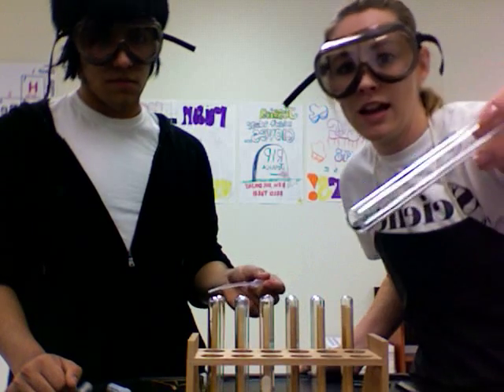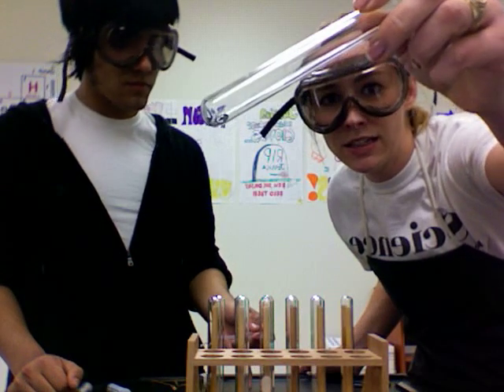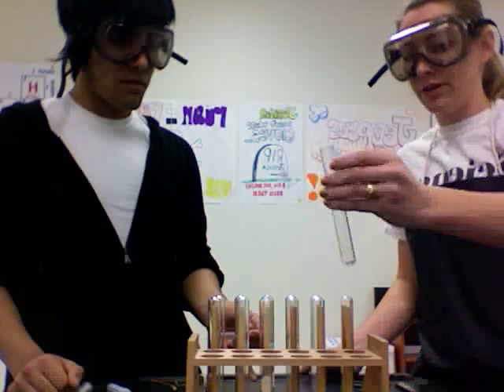Alright, so experiment number two. We're going to take a little solid piece of magnesium and we're going to add to it some hydrochloric acid.